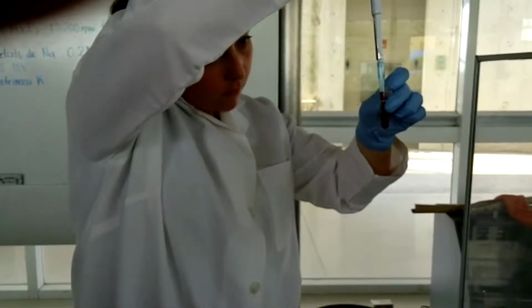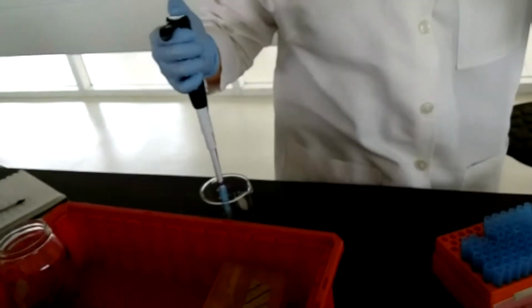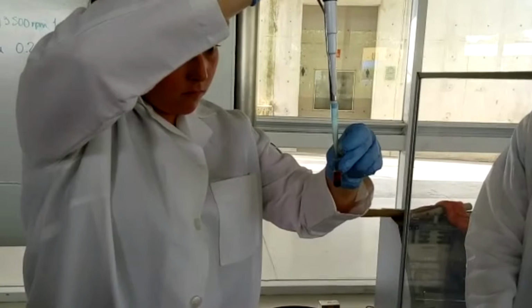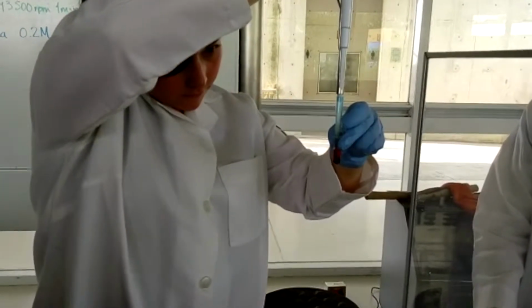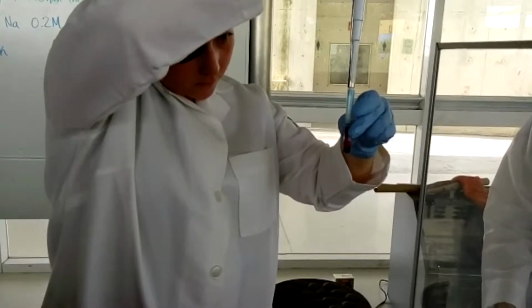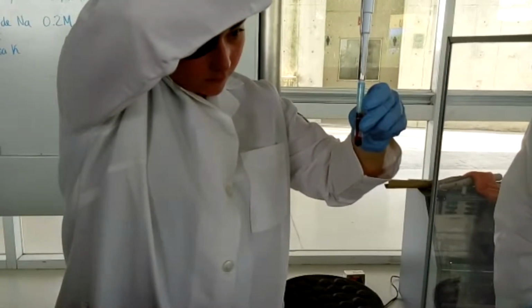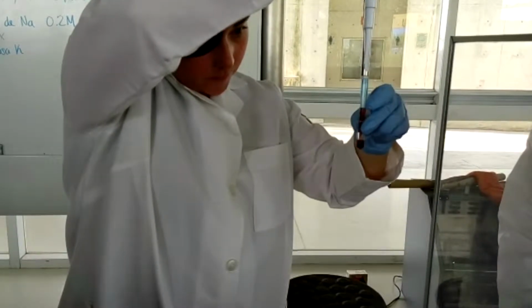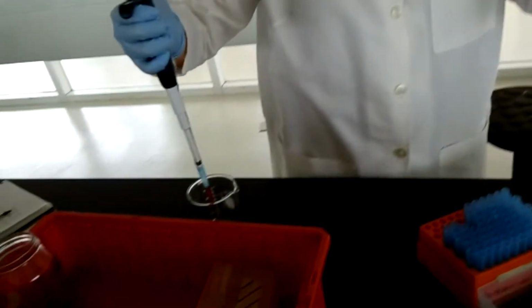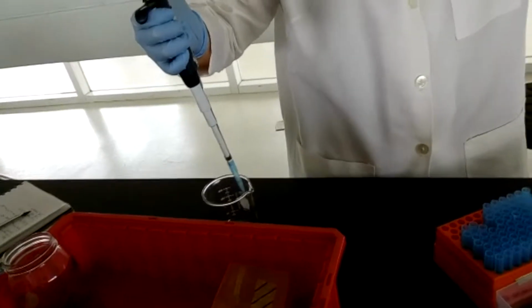The best way to extract RNA is using trisol, a reagent ready for use in isolation of RNA from cells and tissues, and it is not as useful for extracting DNA. While DNA can be stored for a while, the RNA should be extracted the same day that the sample was obtained. And while in DNA extraction we can use RNases to degrade the RNA in the sample, in RNA extraction, obviously, we cannot use this.